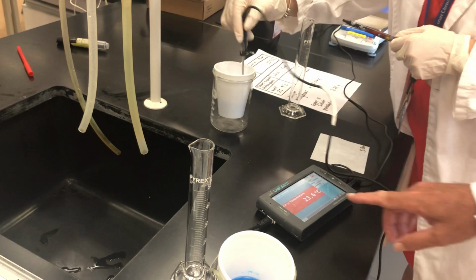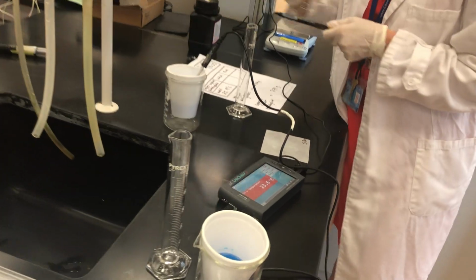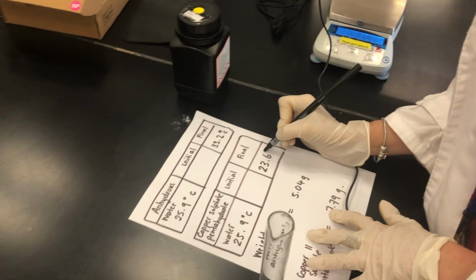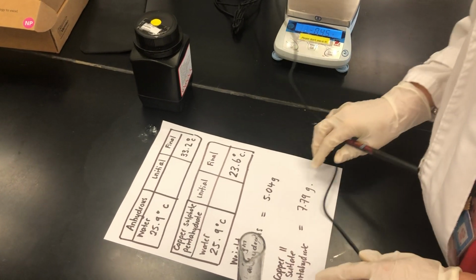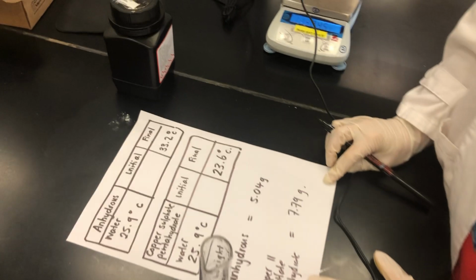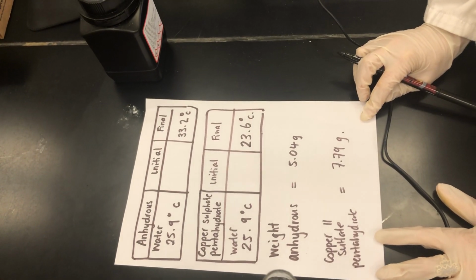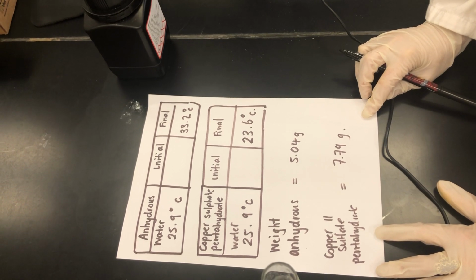Okay, so we got a final temperature of 23.6. So that has dropped more than 2 degrees. Okay, so here's our final table of results, and I'm going to get back to you with part 2 where I go through and perform the calculations step by step for you.